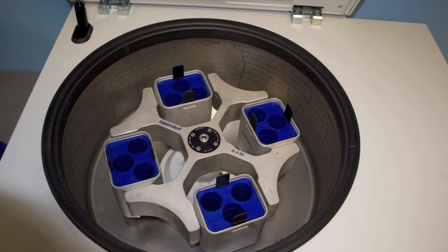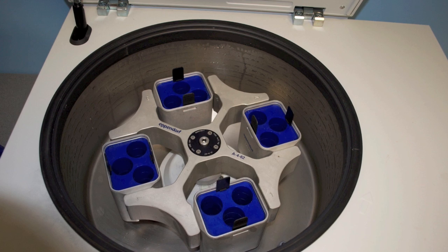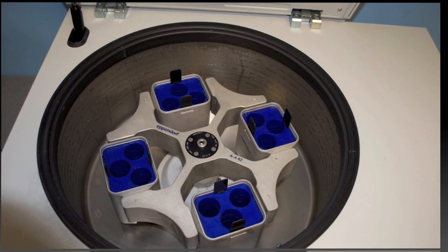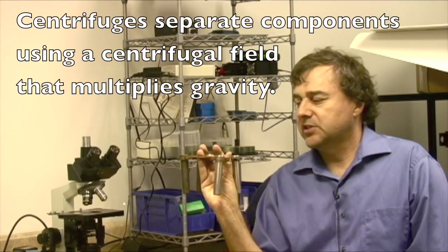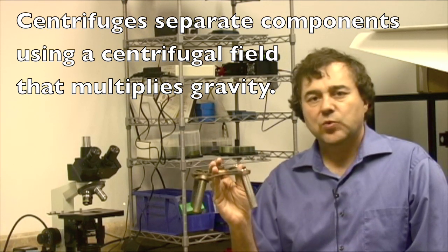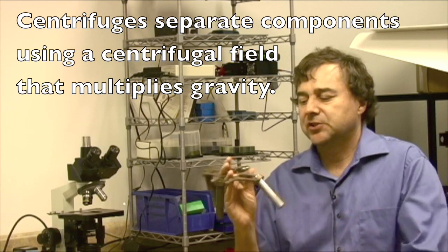This picture is the inside of a common laboratory centrifuge, and what you're looking at is a rotor that's holding four sample holders. I'm holding up a rotor out of a small clinical centrifuge, and as you can see, if I give it just a very quick spin, the buckets want to swing up from centrifugal force into the plane of the rotation.